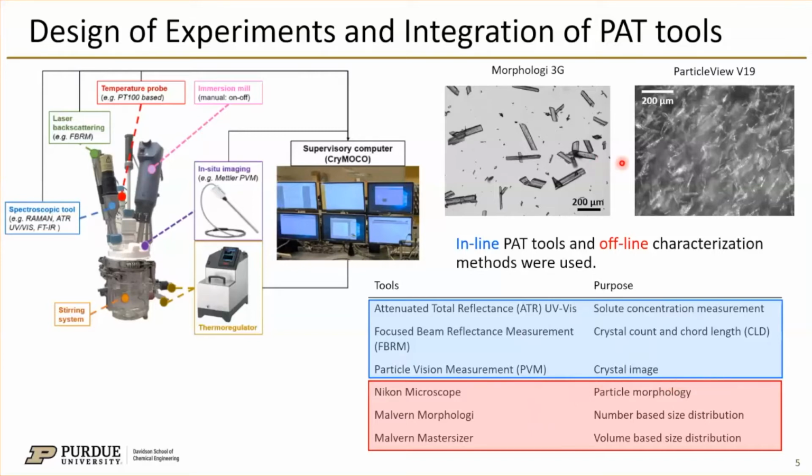The crystals of the commercial API we have, so-called compound A, are shown here in 2 pictures. As seen, they form high aspect ratio crystals. On the left, you see the product crystals after several temperature cycles, while on the right, you see the crystals right after nucleation. It is apparent that they change their size and shape significantly during the batch process with temperature cycles, and our aim was to decrease the aspect ratio of these crystals while maintaining their bulk properties, as these thicker crystals on the left have.